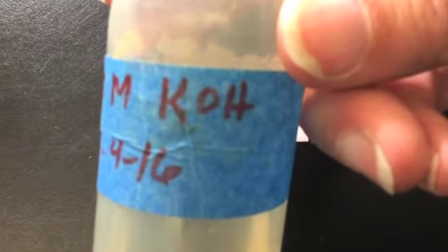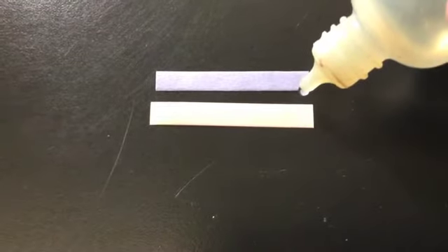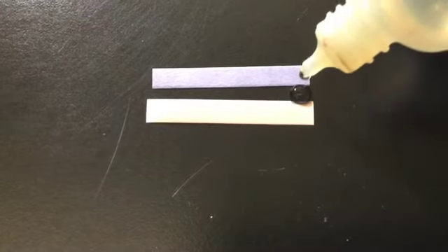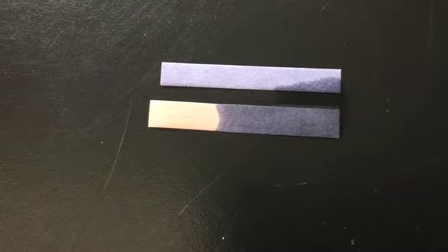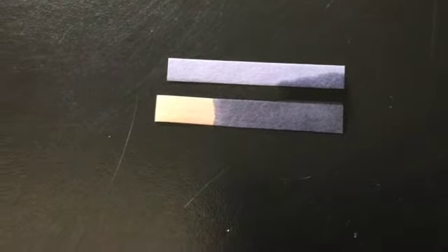I'm going to start by using KOH. Remember that this is a base, and I'm going to put it on this end of our strips. You can see that the pink of the litmus paper is turning to a blue color, while the blue litmus paper basically just looks wet.